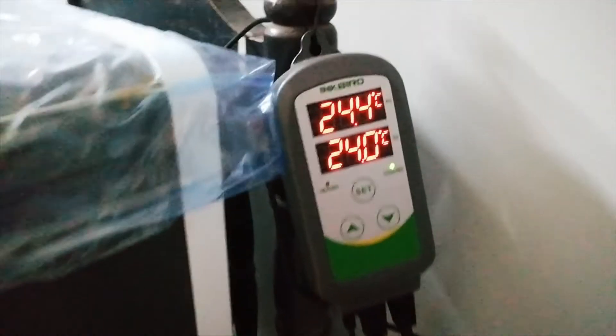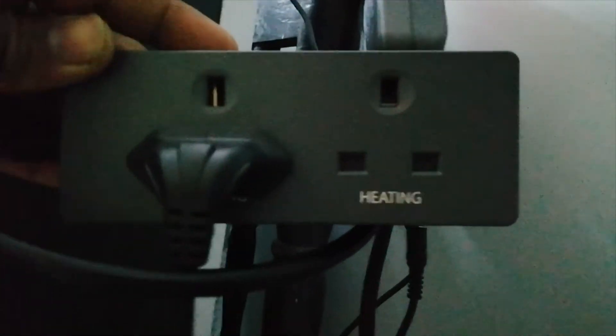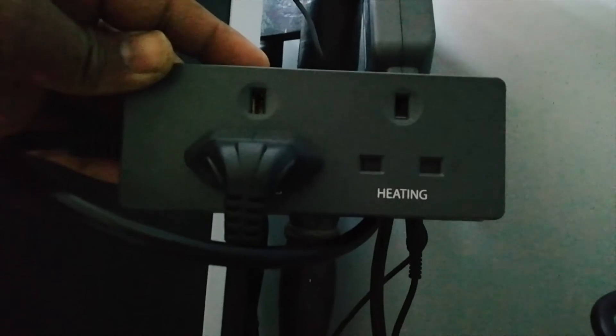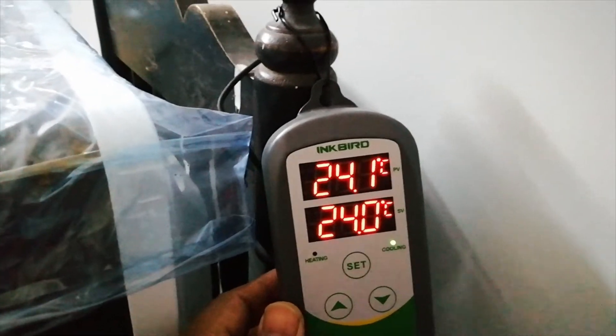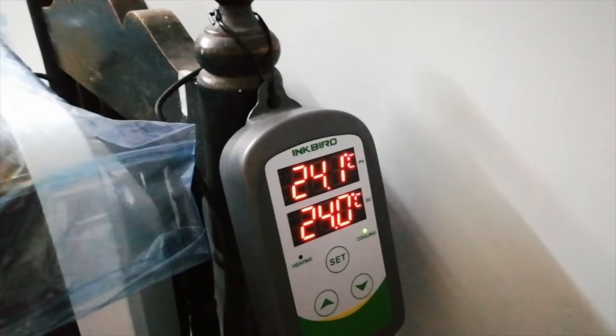Here is the main power — this connects to the temperature controller, and you can see the output. There is a cooling mode output and a heating mode output. My input is connected in cooling mode, so once the temperature reaches 25 degrees Celsius, this relay will release power and switch the fridge on.